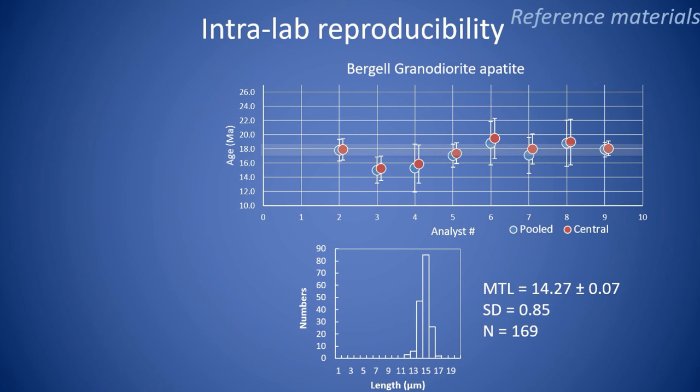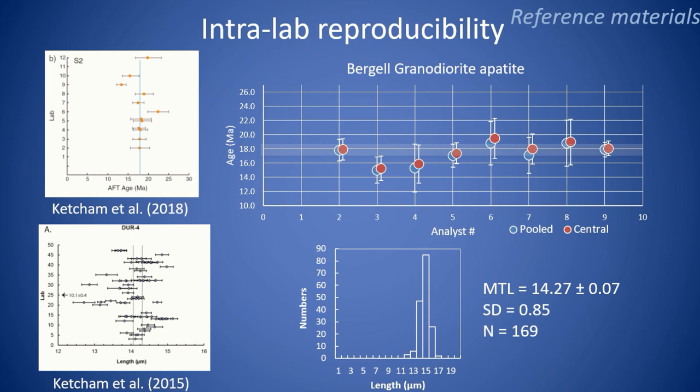All the samples provided have been used for intra-laboratory training at Melbourne over the past 6 years and have been measured by multiple trainees, showing pretty good reproducibility. Images of 2 samples used in previous inter-laboratory studies are part of the exercise for data quality evaluation. Through working on these 2 samples, trainees can compare their results with other labs participating in these previous studies. Again, we include many unsuitable grains in the image collections for grain selection purposes.